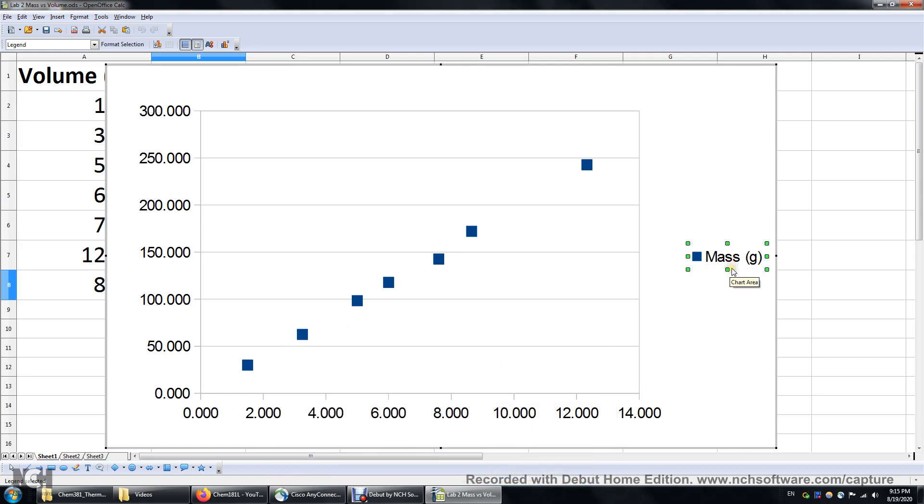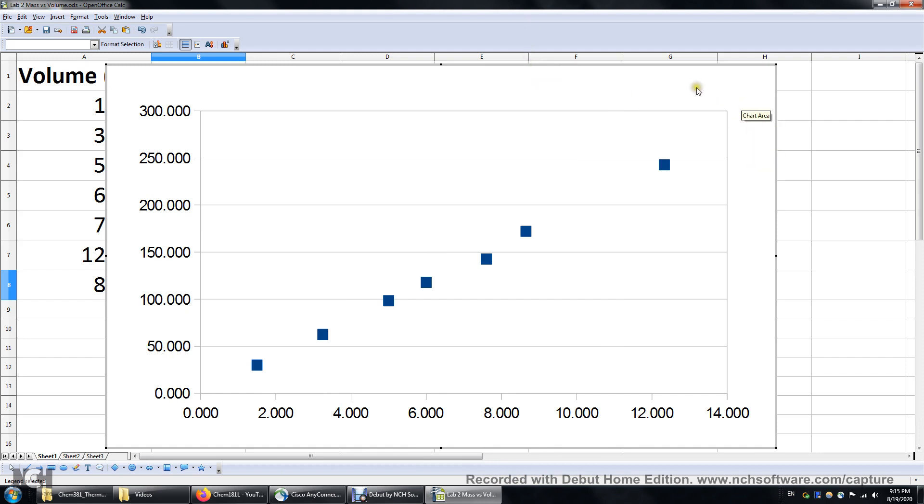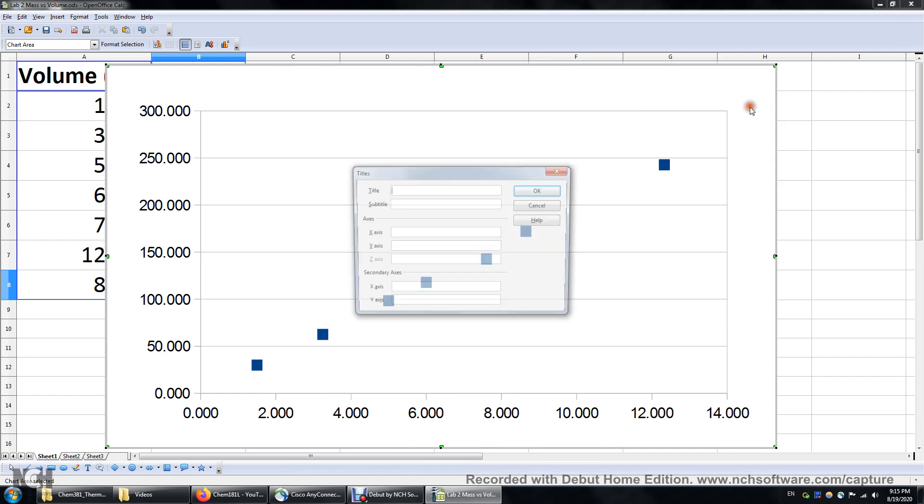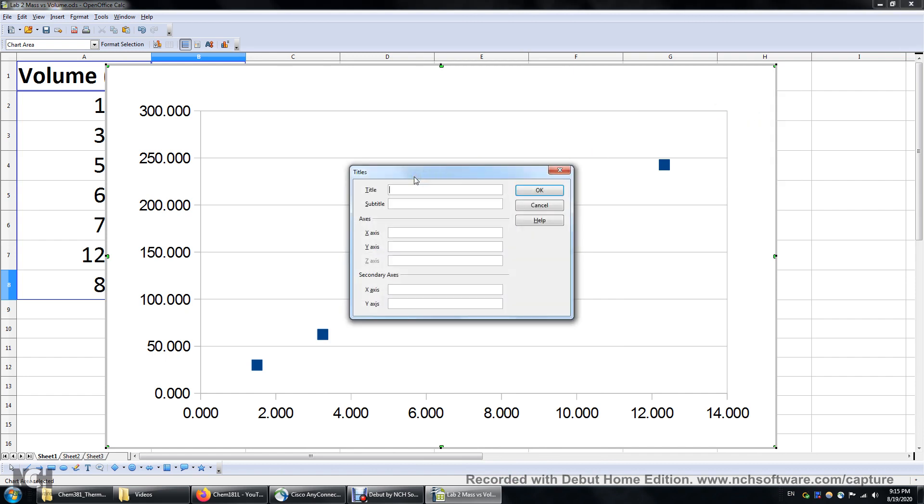We don't need the legend, so I'm going to delete this and then right click somewhere here. Insert titles. Determining the density of unknown metal. You can think of any other title as long as your title is concise and informative. The x-axis is the volume in milliliters. The y-axis: mass in grams.